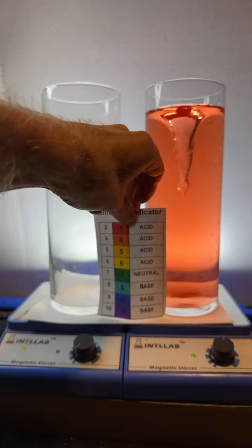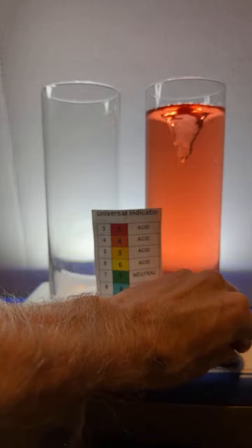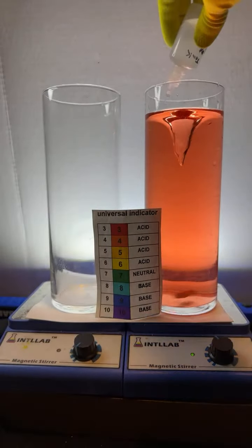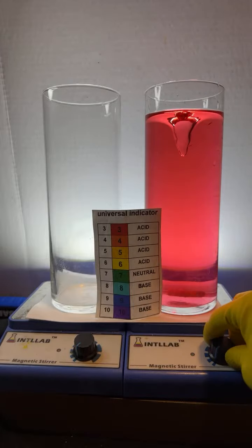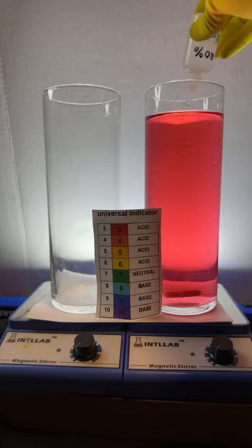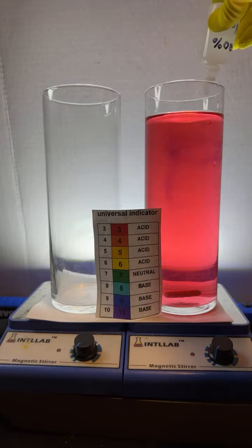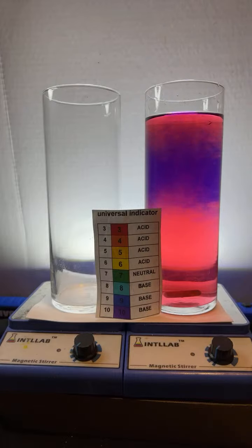We're still going to need that, so we've got something to look at. I'm going to slow this down. Let's actually make this acidic while I'm getting the other experiment ready. So I've got a lot of acid in there. And then I'm going to turn this off, and we're going to put some base in up here and see what happens. There we go. See what happens over time as the acid and base mix over there on the right.